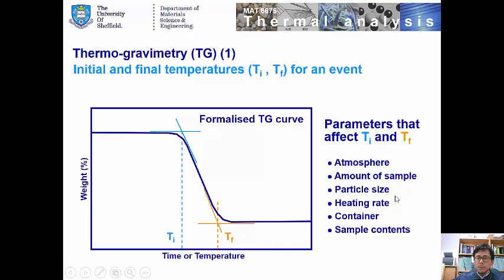And also amount of sample and particle size. Very often samples are powdered, but particles of powders can again influence these temperatures. Heating rate and the material itself also. So usually, if you do not know much about your material, you might have to do measurement a few times to obtain good data.